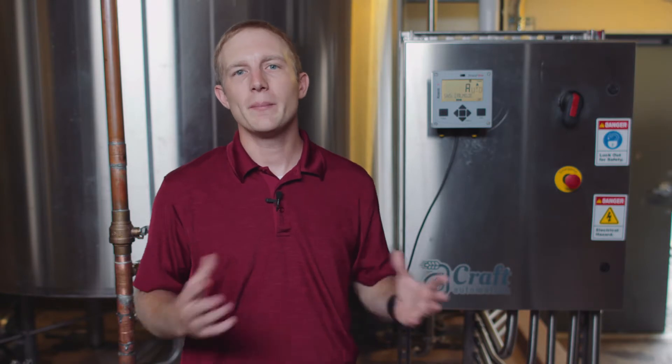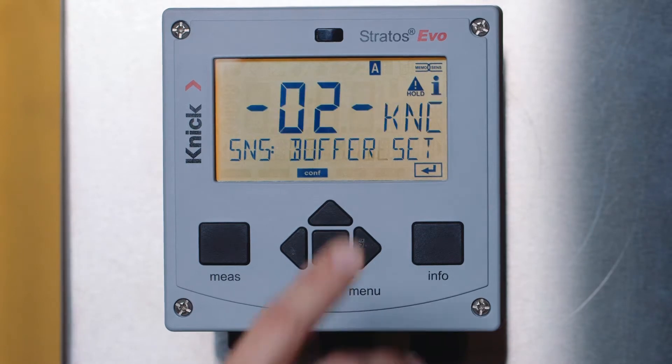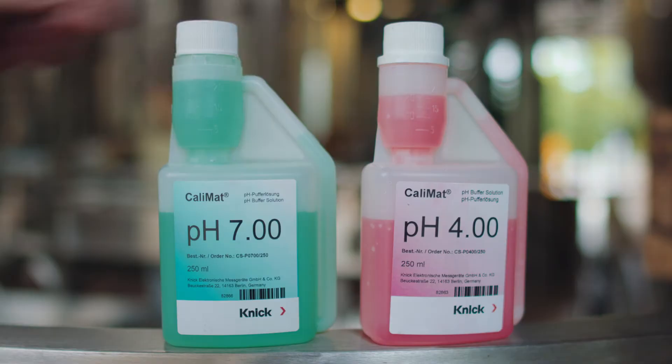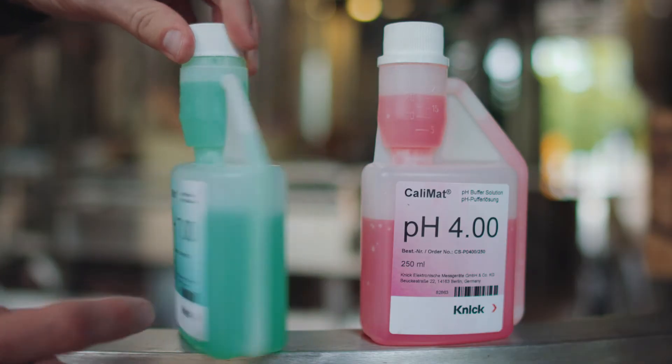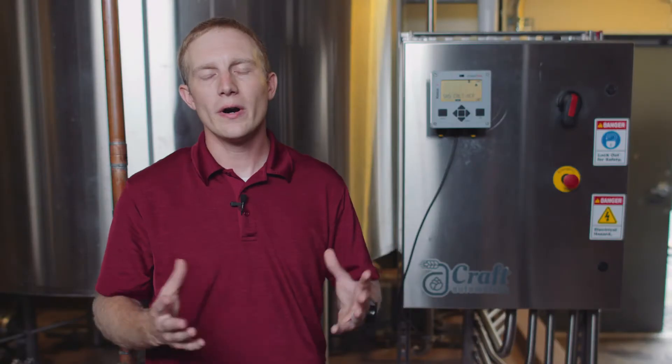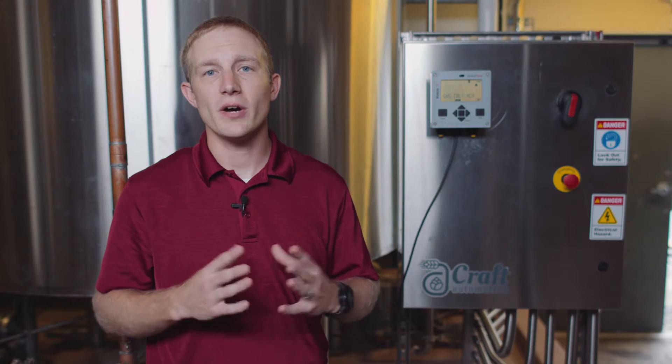Next, we see the calibration mode for our pH sensor. We recommend Auto, which provides automatic buffer recognition and temperature compensation of the buffers. Once we select Auto under the calibration mode, it offers us the opportunity to select which buffer set we are using. The most common buffer set on the market is NIST Technical, which is option 4 in the transmitter. You can verify your buffer set by checking the labeling on the bottle. The calibration timer allows us to set either a fixed interval or an adaptive evaluation based off sensor loads for indication that a calibration is needed.